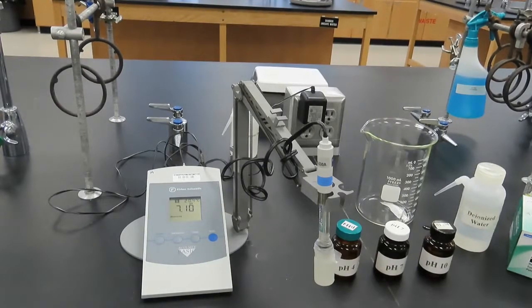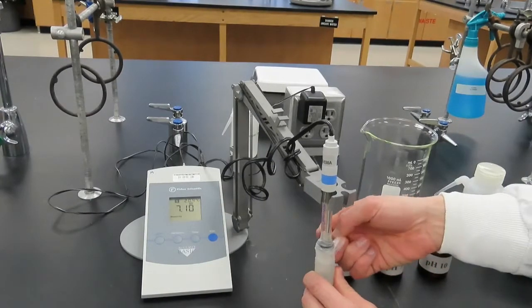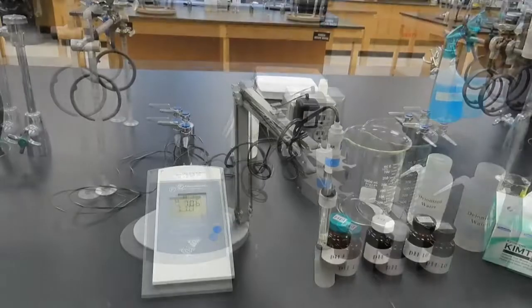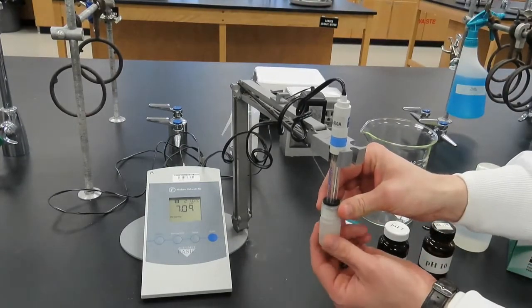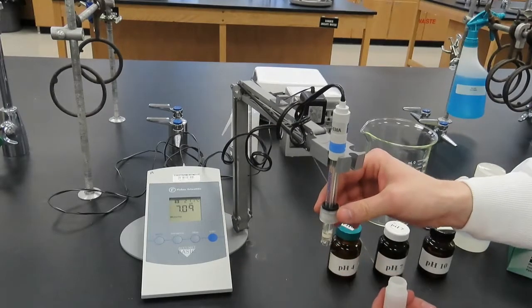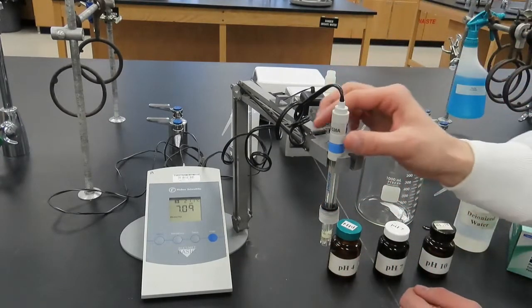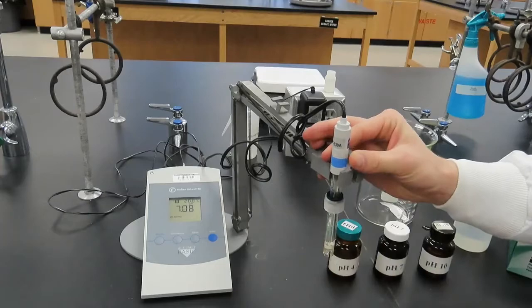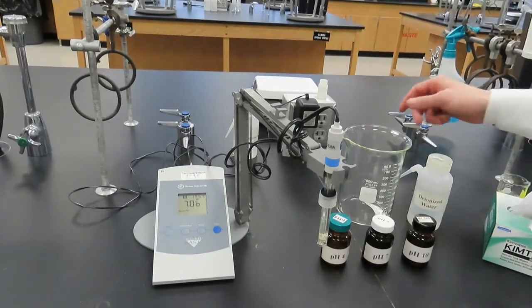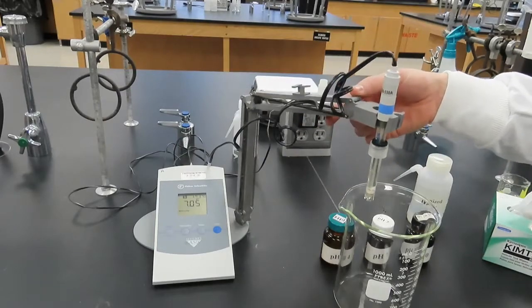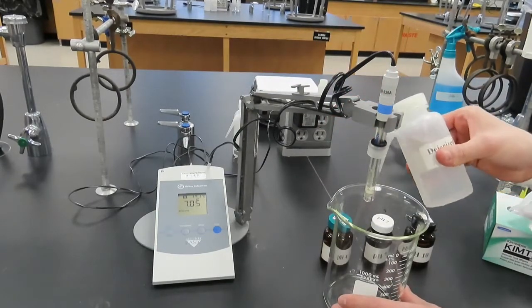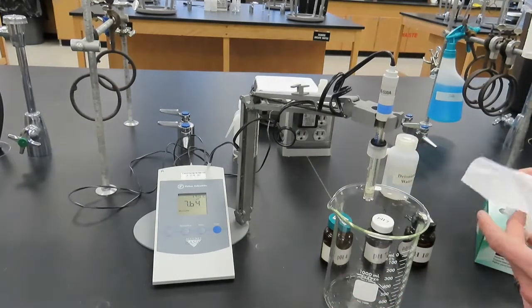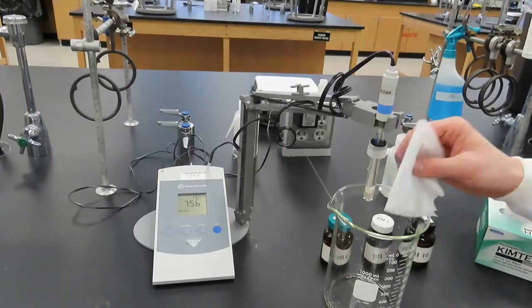First, remove the pH electrode from the storage bottle. Hold the cap and rotate the bottle to unscrew it and place the bottle in a secure location where it is unlikely to be tipped over. Push the cap with its O-ring up a few inches on the electrode. To minimize contamination, we will always rinse and dry the electrode between solutions. With a large beaker placed underneath the pH electrode, thoroughly rinse the electrode with deionized water. Then pat dry the electrode with a chem wipe tissue. Do not wipe dry.